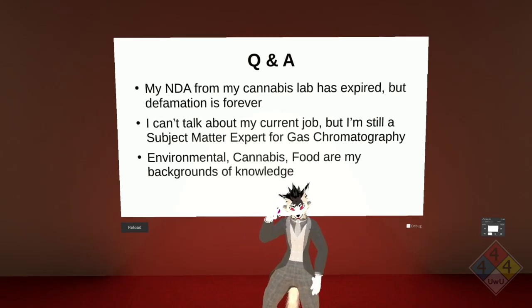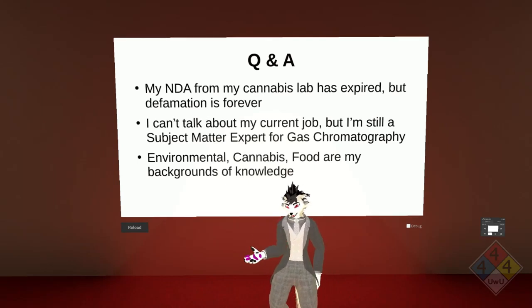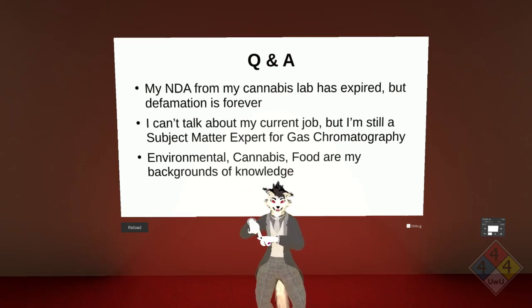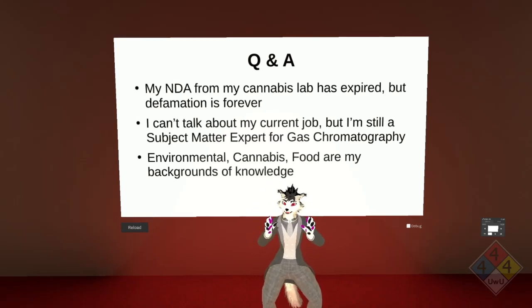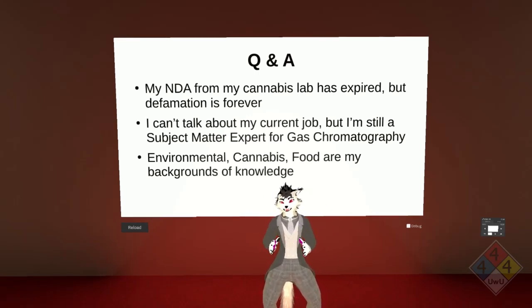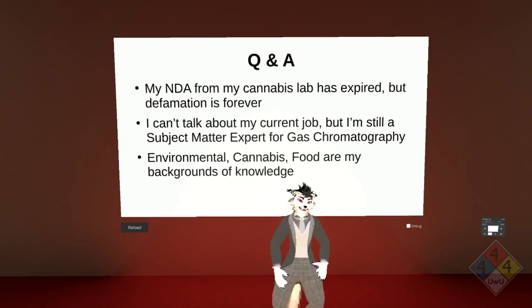One comment that I also like, people ask me how feasible is it to do residual solvents and terpenes on the same injection, on the same instrument, on the same column. Hypothetically, it's doable, but because the concentration reads are so vastly different, it usually exceeds the linear range of detection to do it in a single injection. Usually you have to do it in multiple detections. Of course, a lot of this depends on what your state requirements are. What are the numbers, your action limits is what I refer to them. What are your actual goals here? So if they're easy, you can use fewer instruments. If they're difficult, you have to use some really expensive stuff.